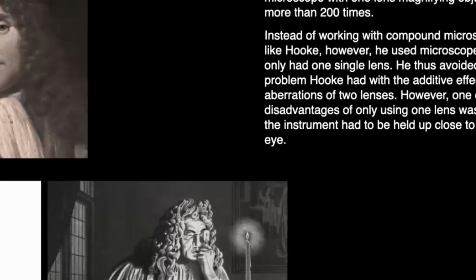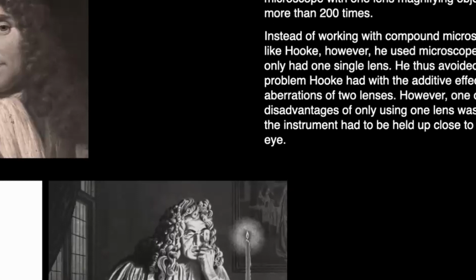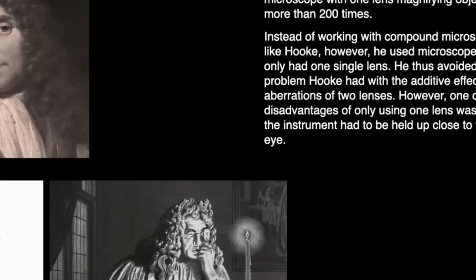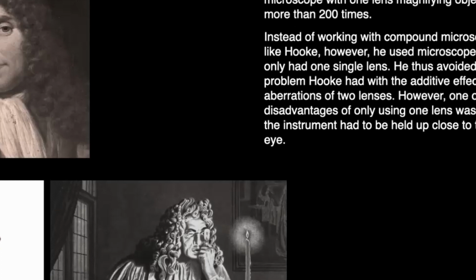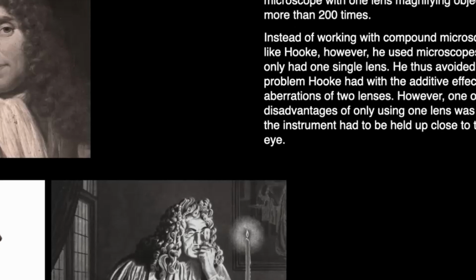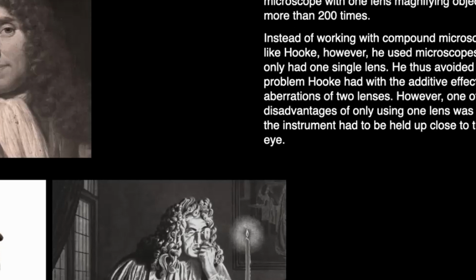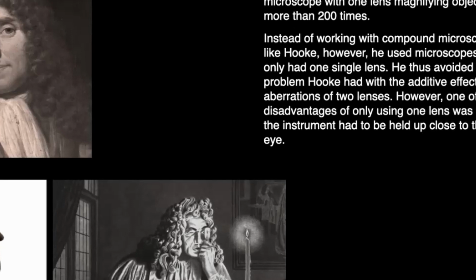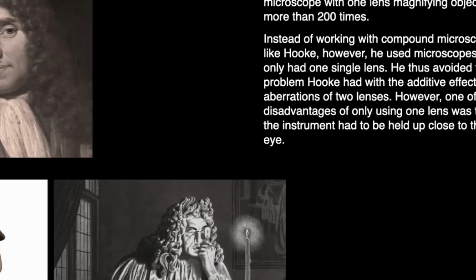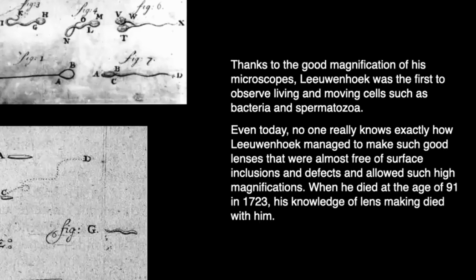But anyway, it was actually Van Leeuwenhoek who, in approximately 1675, developed this kind of microscope. This is a very tiny microscope. It was small like a thumb. It has one single lens there, and this pin here, where the sample was attached, and then he was holding it against light right in front of his eye, and he could see things for the first time that nobody had ever seen before. These lenses were capable of magnifying enormously for the time, like 200 times, and he saw and described sperm and bacteria for the first time.